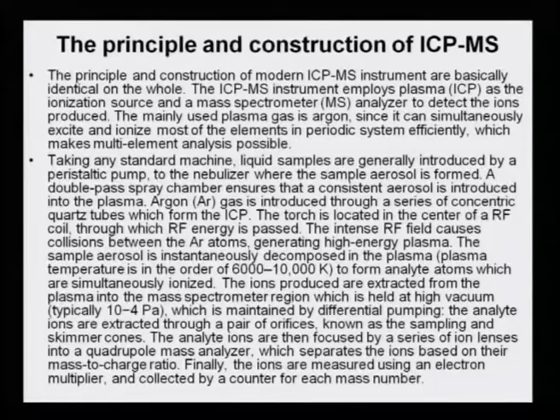The principle and construction of ICP-MS. Now, how does this machine look? What are the different parameters that have to be kept in mind? The operating conditions are very important. The principle and construction of modern ICP instruments are basically identical on the whole.